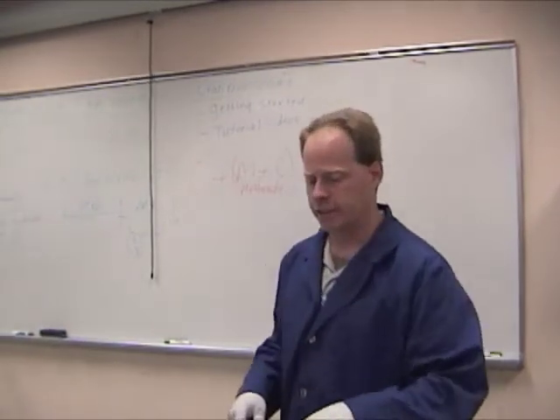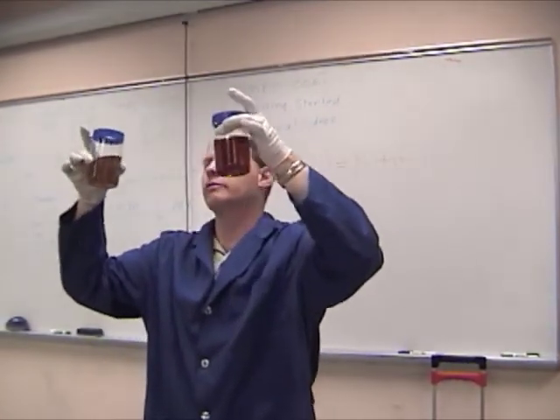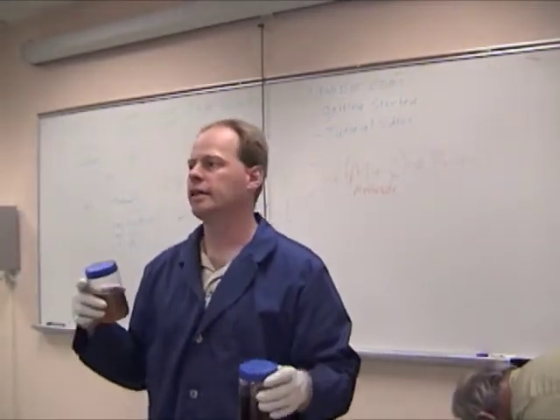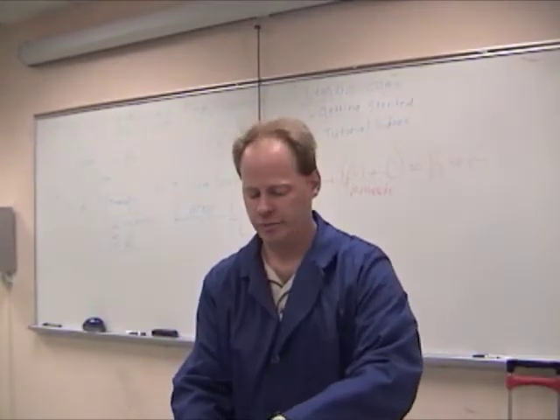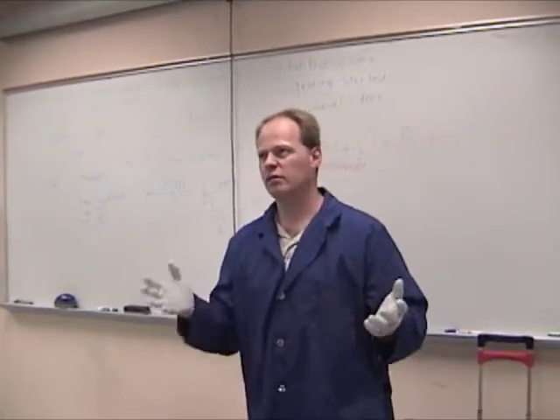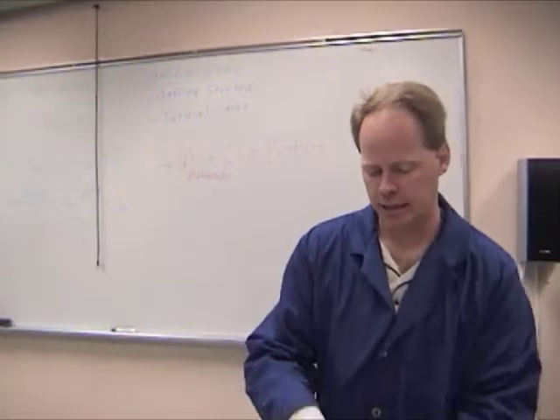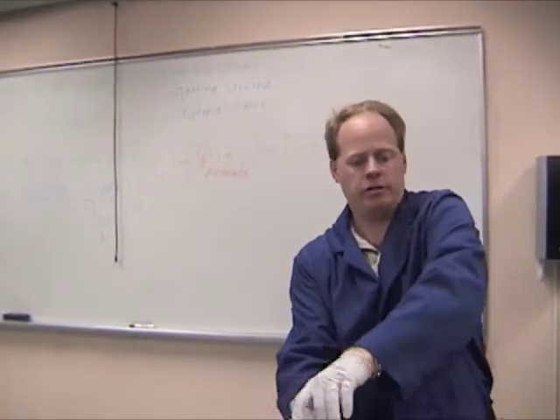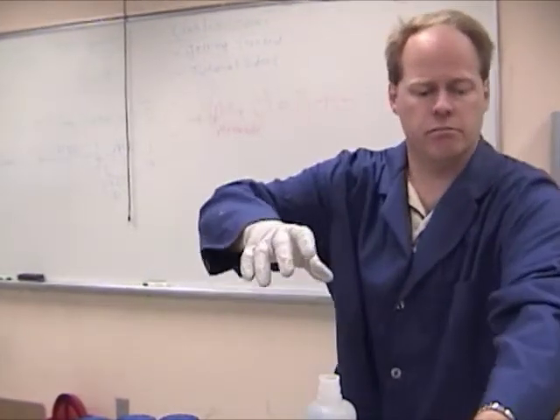Okay, let's do an actual titration. So I have two things of oil here. One of them's good, and one of them's bad, and I don't know where they came from. We want to see how good it is. If any of you went to the other session, they talked about a titration of three. What's that? Well, we're going to find out. Okay? So I'm going to add some titration solution. Pull some syringes out for me. Can you pop some clear... Yeah, you bet. Let's move this out.